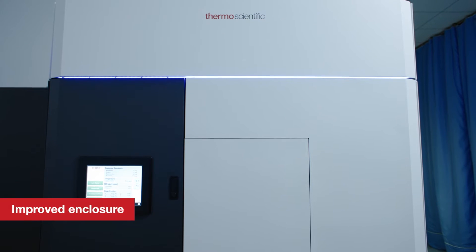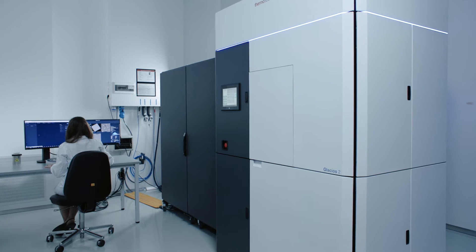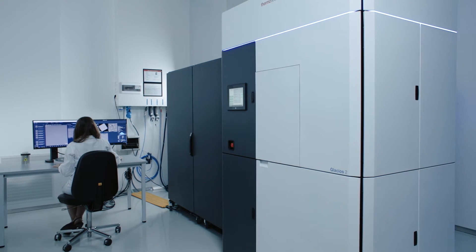The new enclosure protects the system from environmental fluctuations, increasing stability, giving users confidence that the acquired data is high quality.